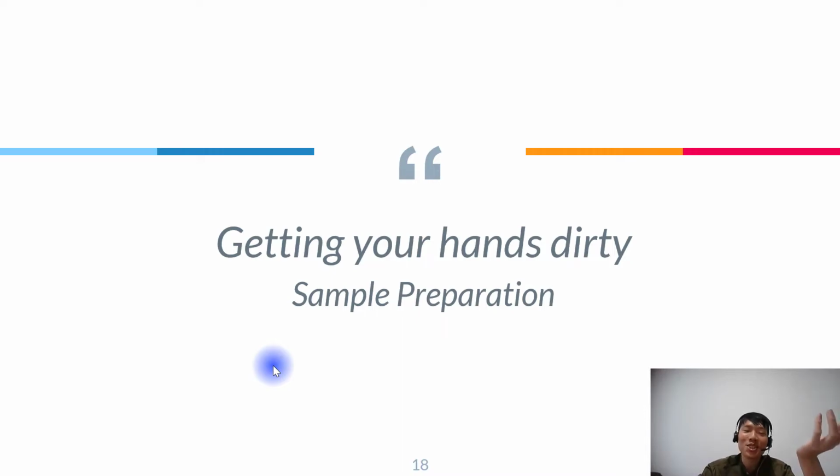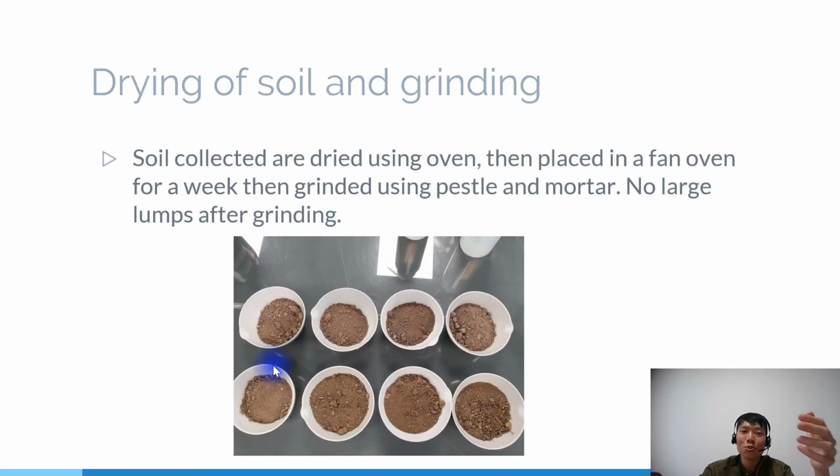You got your hands dirty just now, you wore a glove, right? But still it's dirty. Sample preparations. Now, we bring it back to the lab here. What do you do here? So you collect the soil and then dry it in an oven, okay?